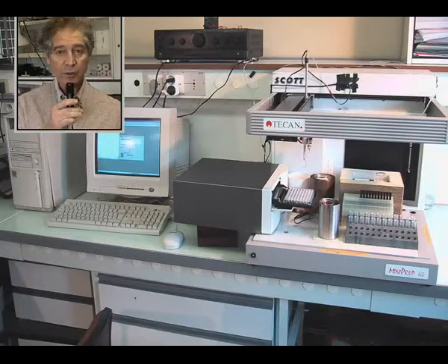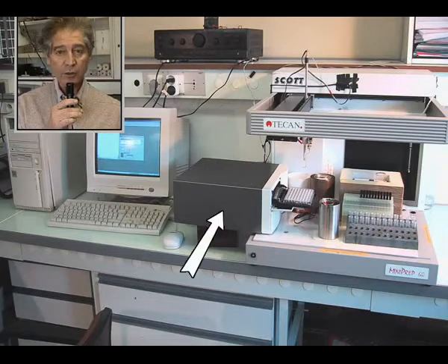Now you see the general layout of the system. There is a computer that will deliver the signal, the amplifier with a tester on the top of the amplifier. On the right, you see the automatic analyzer itself, including a spectrophotometer with a 96-well plate.